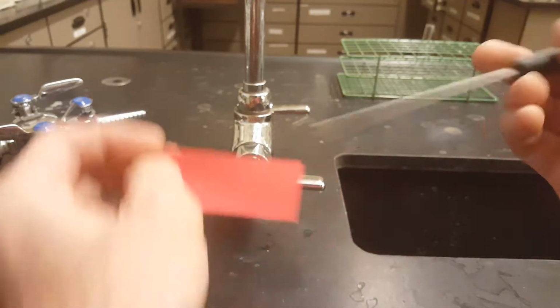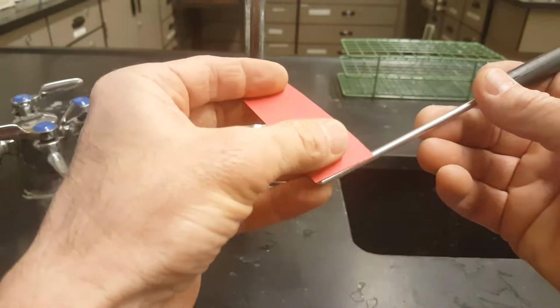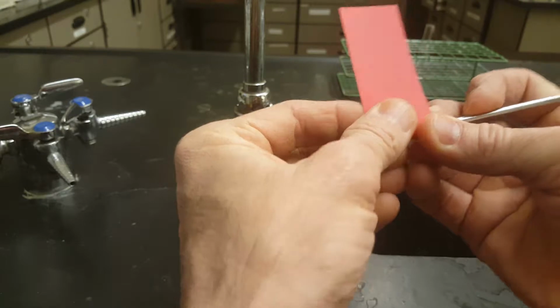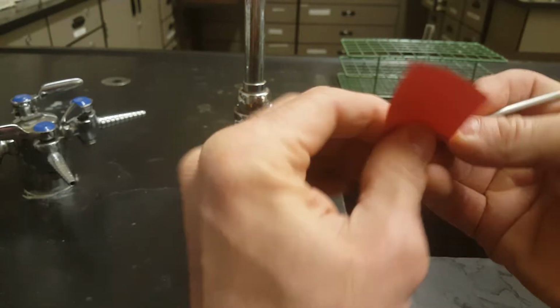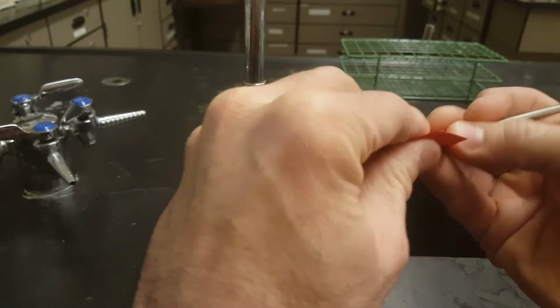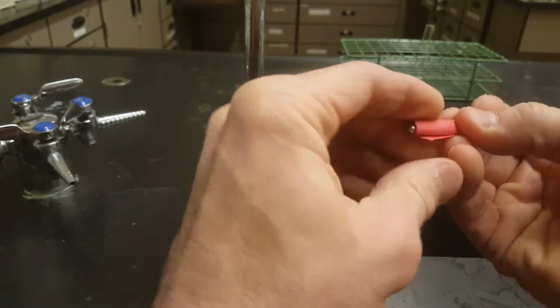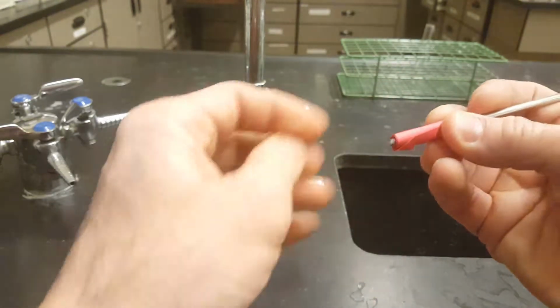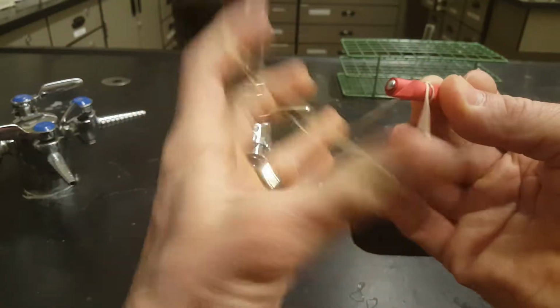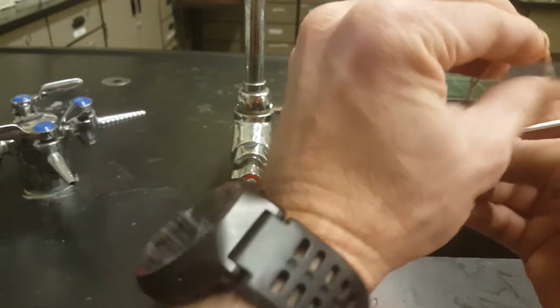I have these papers that are pre-cut for you, and you want to wrap them around the tip of your thermoprobe, and then take your rubber band, and the rubber band will hold this on tightly if you have the rubber band on the paper and on the thermoprobe itself.